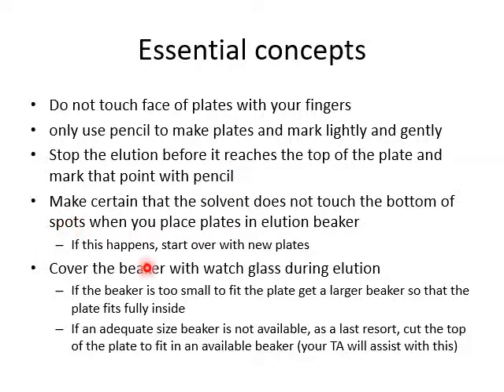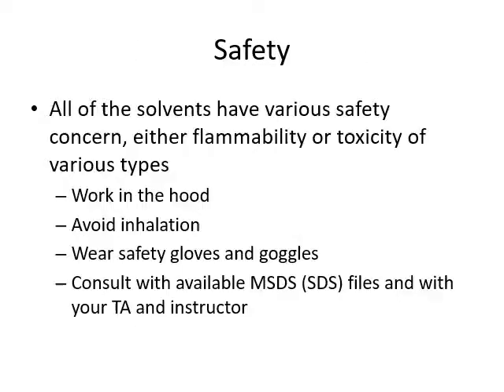You cover the beaker with a watch glass during the elution to make sure that the solvent does not leave the system. If the beaker is too small to fit the plate, get a larger beaker. If an adequate size beaker is not available, as a last resort, you cut the top of the plate to fit in an available beaker. But I would, of course, help you with all of this.